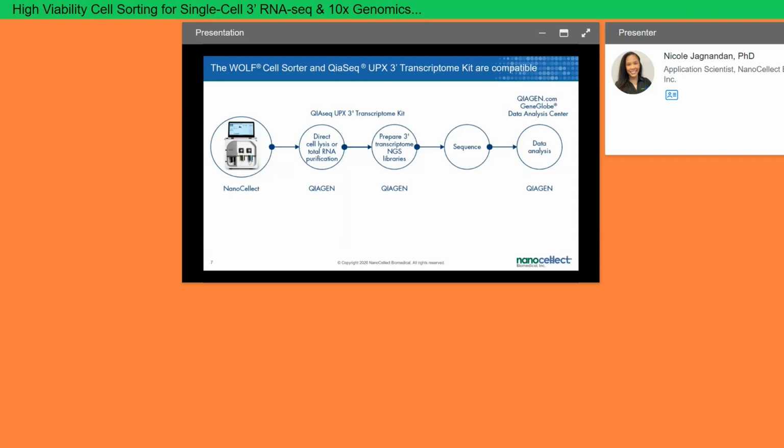dispense those single cells into 96-well QIAseq plates, which are preloaded with a cell lysis buffer. So those cells then lyse, and single-cell RNA can then be reverse transcribed, and each RNA molecule is then given a unique molecular index, or UMI. With that, they're also assigned well-specific cell IDs, up to 384 wells. And then following reverse transcription, with integrated template switching, all those cDNAs can be combined into one tube, enabling a full library construction.